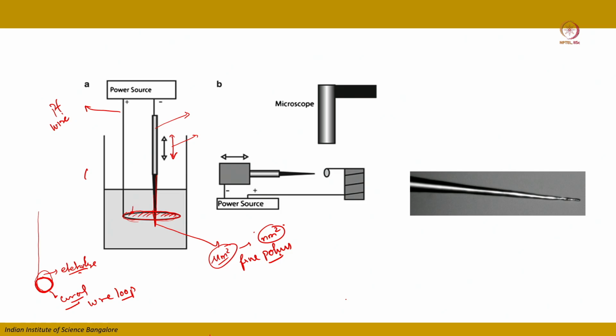And by this arrangement, you can do up and down movement into this particular electrolyte, until this particular tip surface becomes a few nanometer square cross sectional area, and the DC power supply is continuously applied across these needle specimens.